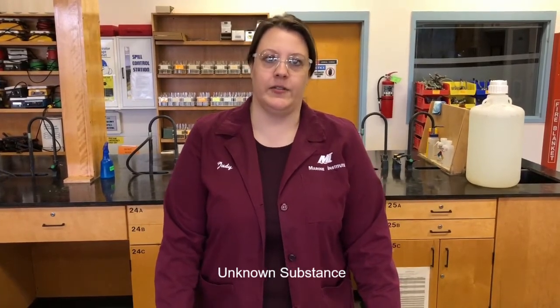One way we can try to find the identity of an unknown substance is by comparing it to substances that we know the identity of. So what we're going to look at today is 6 common substances, and then we're going to test them and look at their chemical and physical properties. And then we're going to take an unknown substance, an unidentified sample that we know is one of those 6 that we tested. And by comparing the properties of the unknown sample to the known samples that we have already tested, we should be able to identify that unknown substance.